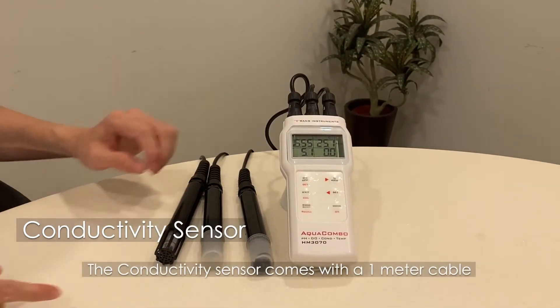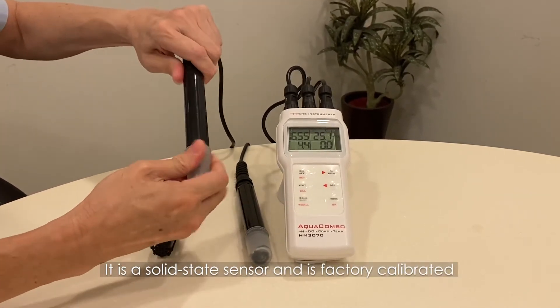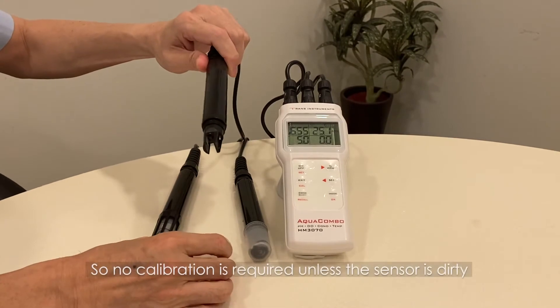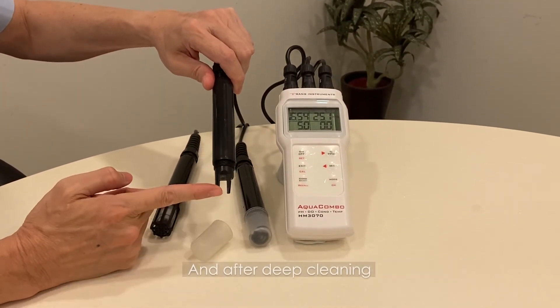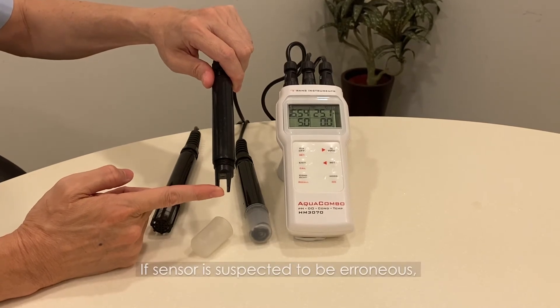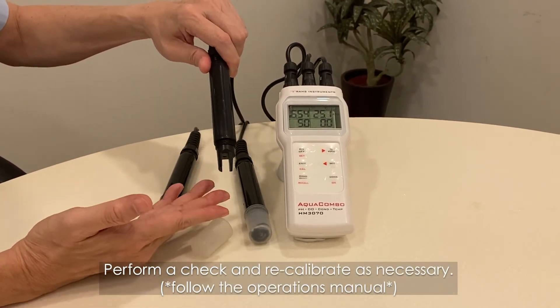The conductivity sensor comes on a one-meter cable. It is a solid-state sensor and is factory calibrated, so no calibration is required unless the sensor is dirty or has undergone deep cleaning. If the sensor is suspected to be erroneous, perform a check and recalibrate as necessary.